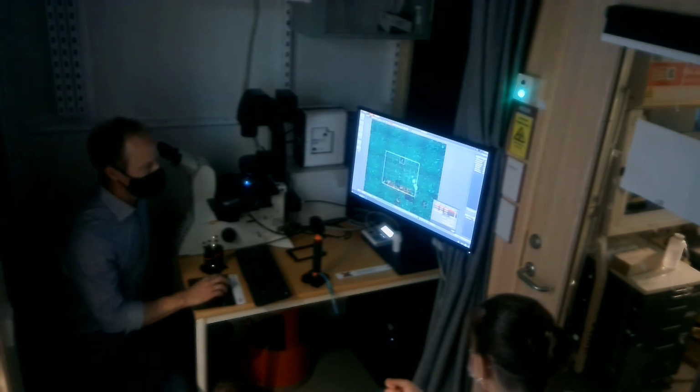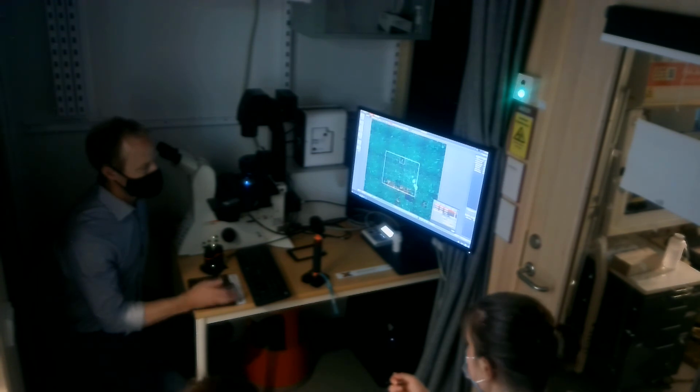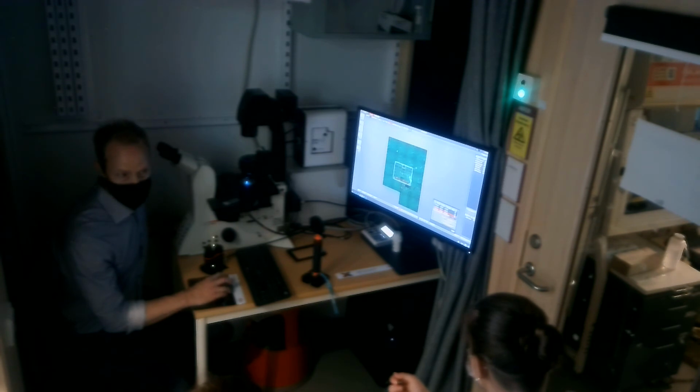I'm not sure I follow, but what I would say is that it would use the plane that it will calculate, the focus plane it will calculate with these 3. That plane would continue outside. However, if I put focus points, I would typically make sure that everything that I image is within my focus map. So if I wanted to image something out here, I would probably put either one more or move this one outside, so that I have more focus points from my focus map.